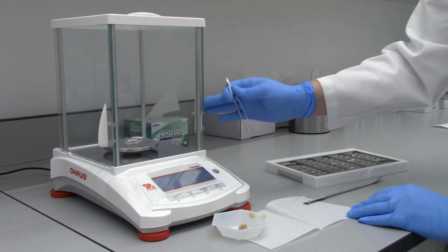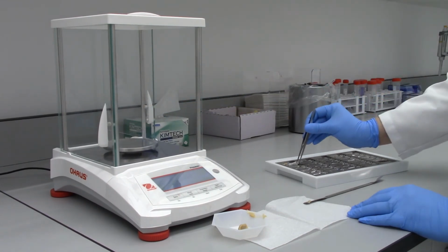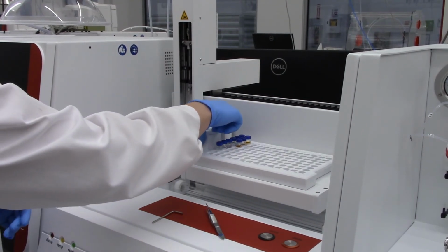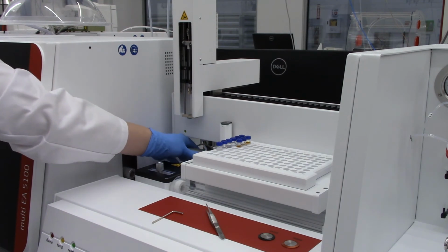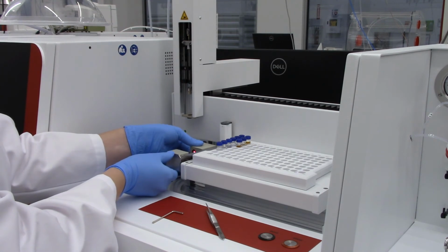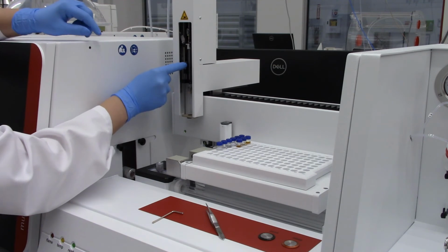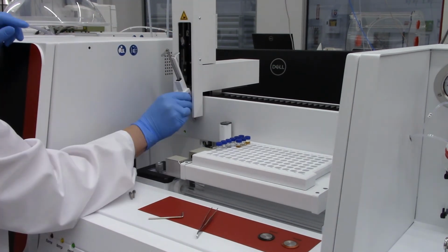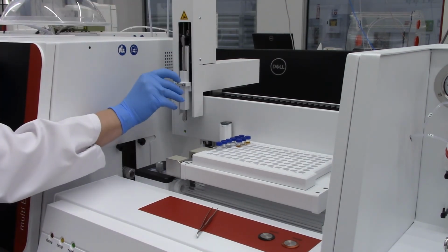Now the liquid samples are done, and it's time to convert the multi-matrix sampler to the solids configuration. First, we remove the reservoir for the rinsing solvent and replace it with the boat sensor. The boat sensor will later detect the quartz boats and make sure that they are being transported correctly. Then we remove the dosing syringe and replace it with the gripper, which will later transport the quartz boats between the different positions.